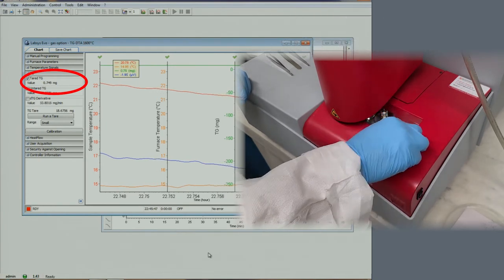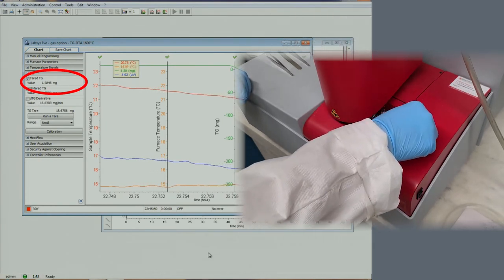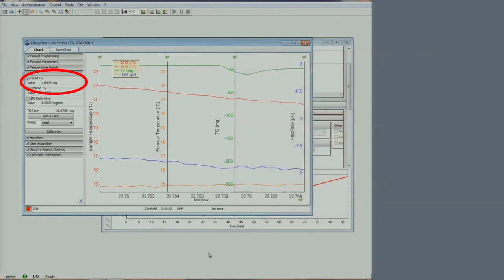Press the cover back in to create a tight seal. We are now done preparing the instrument for the measurement. The tared value is now very small.